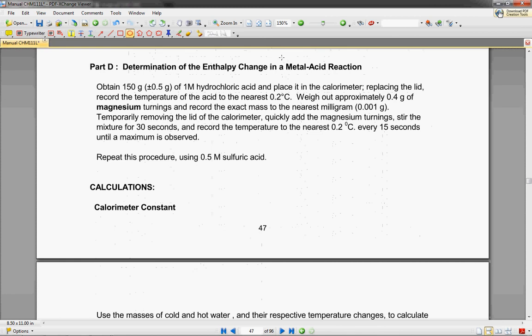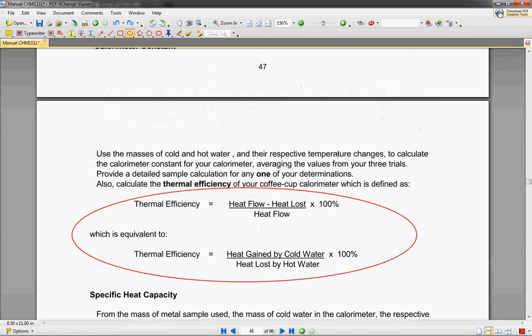And then our final one will be a reaction with a metal acid, to see how that will produce heat or not produce heat. So we have magnesium and we're going to mix that with hydrochloric acid in the calorimeter. And so we're going to then, of course, observe and repeat this procedure using less strong acid and see how much heat it gives off.